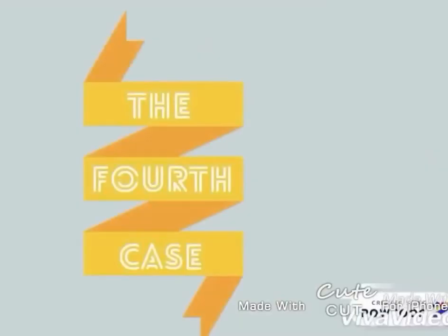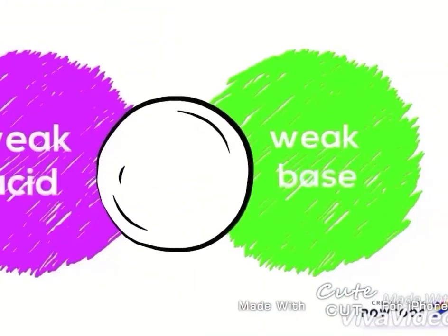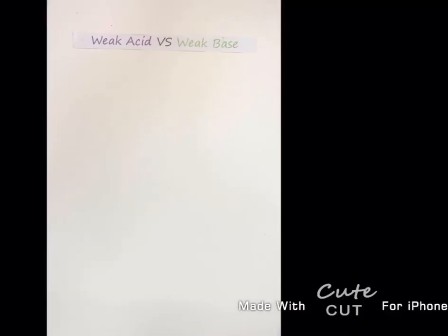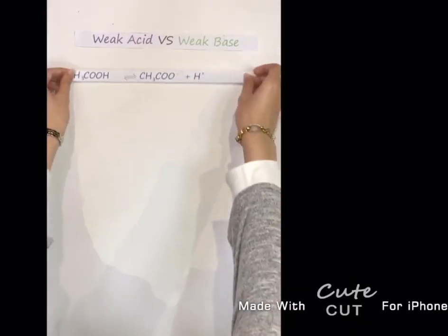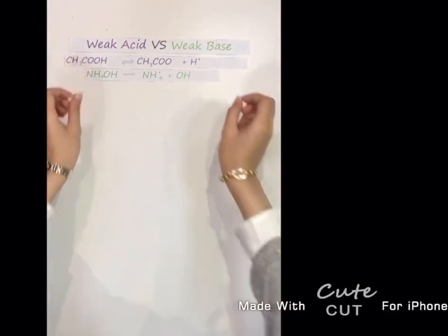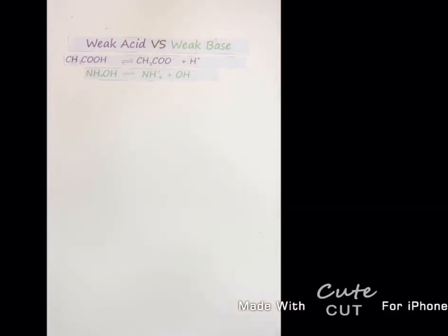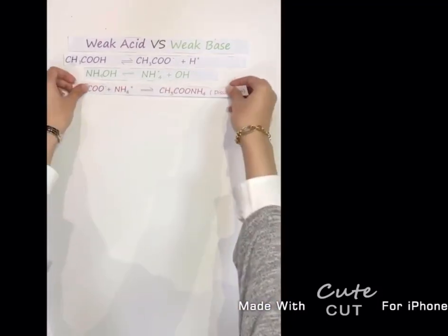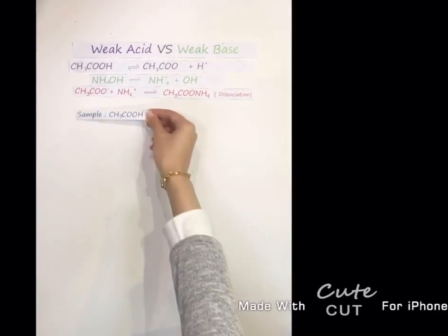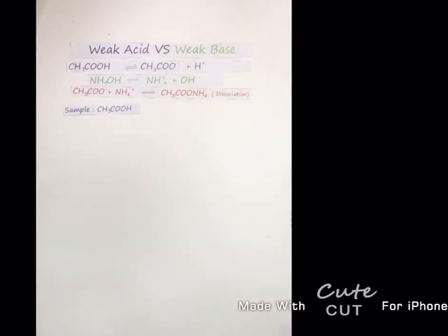And the fourth case is weak acid against weak base. The weak acid is acetic acid, which is incompletely ionized. The weak base is ammonium hydroxide, which is incompletely ionized. Due to the presence of free ammonium ions and free acetate ions, ammonium acetate salt will be formed. The sample will be acetic acid and the titrant is ammonium hydroxide.